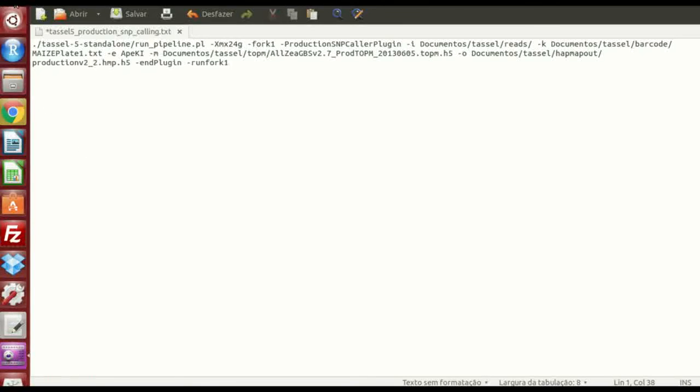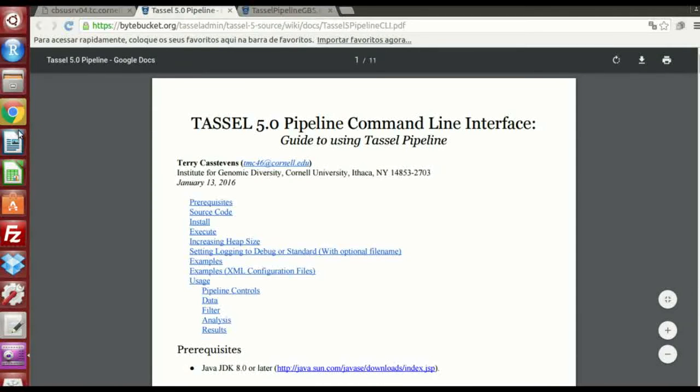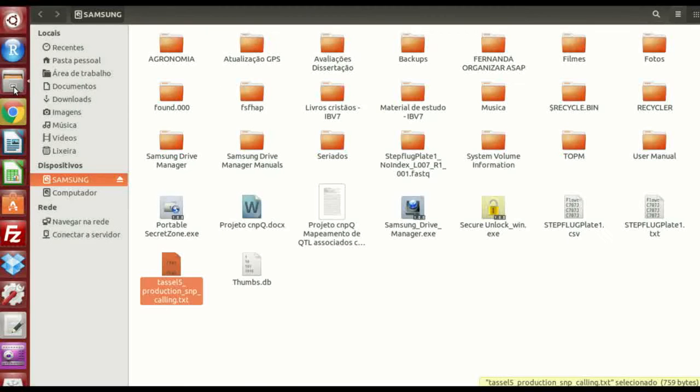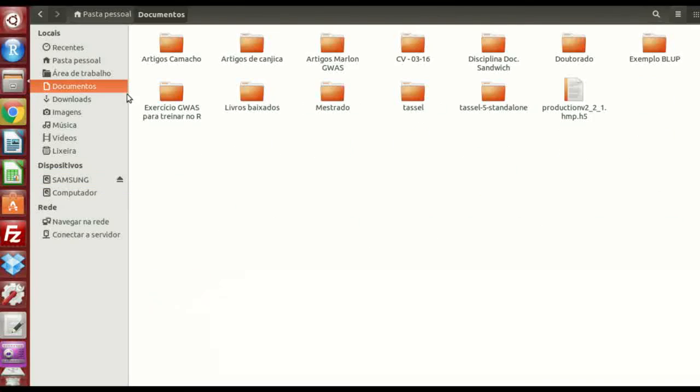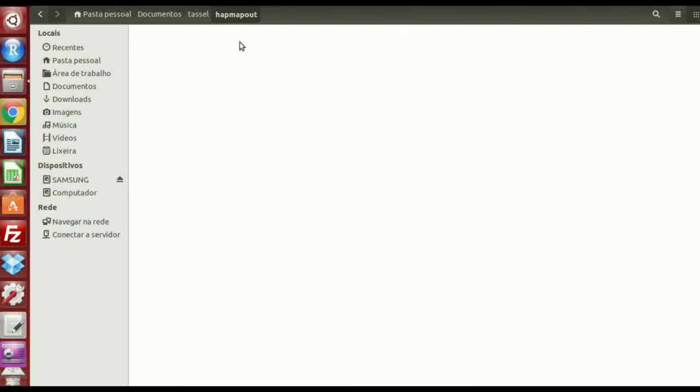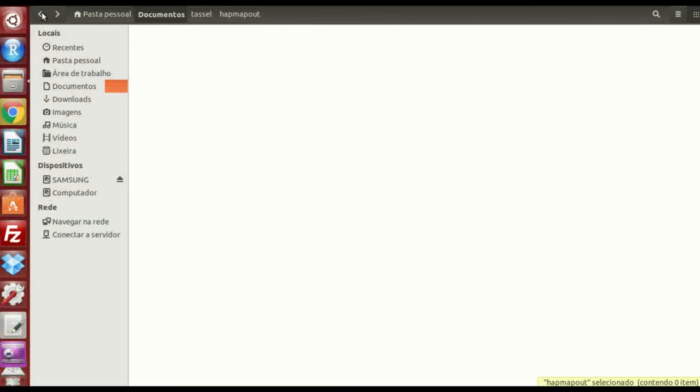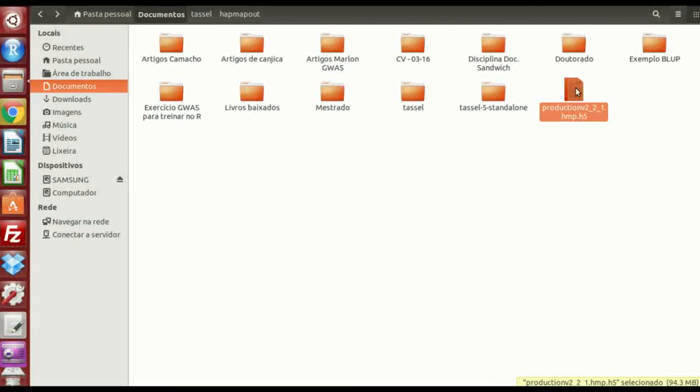I'm just not going to do it now. Because I don't want to crash my computer. Okay? So after you do this, it's going to run pretty well. I made it several times. You're going to see that in your file called HapMapOut, you're going to have an output file. And you can open that on tassel and take a look how it is. That's what we're going to do right now.